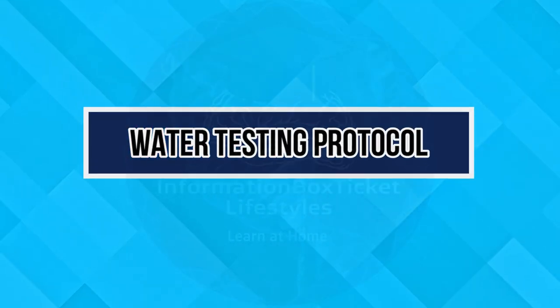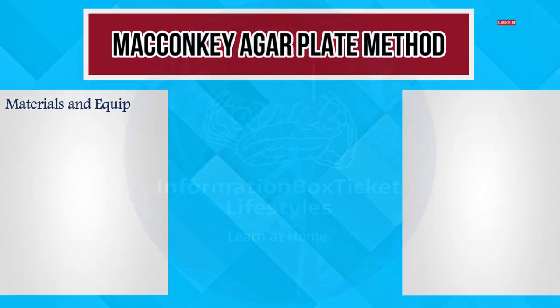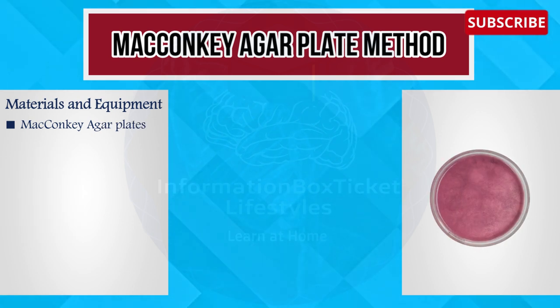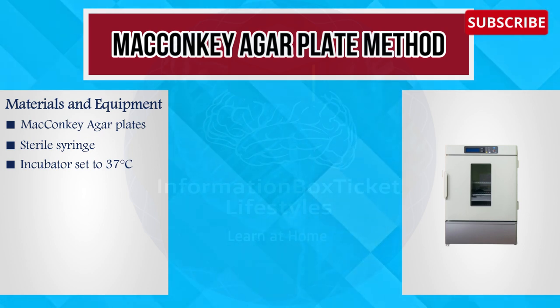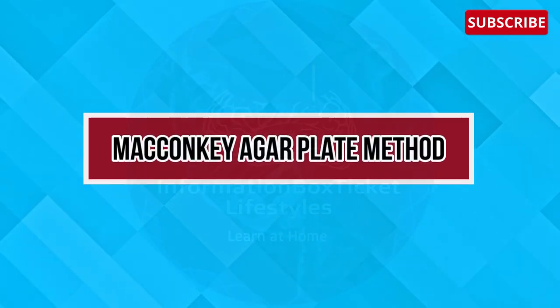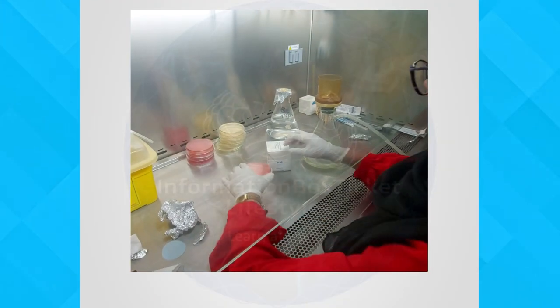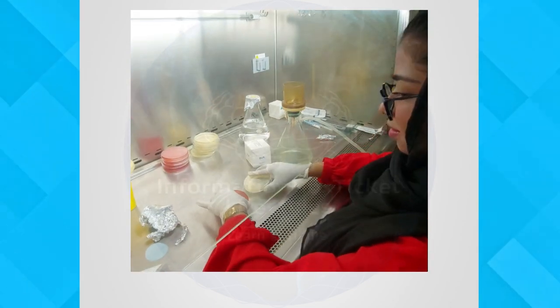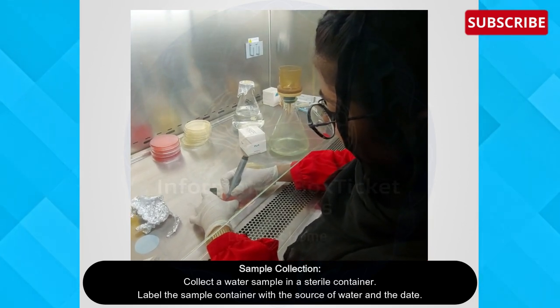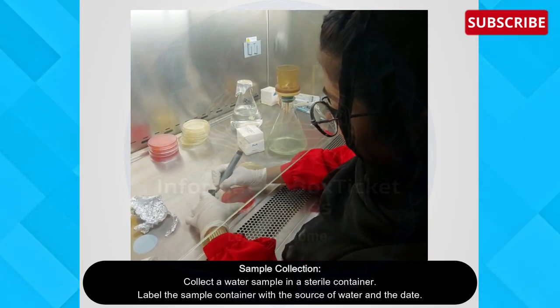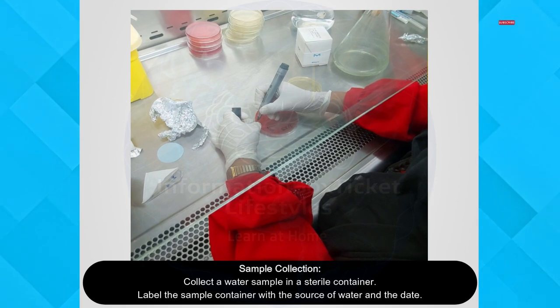Now let's begin with the procedure of water testing. The first test is the MacConkey agar plate method. Let's start with water testing through the MacConkey agar plate method. Ensure the MacConkey agar plates are sterile and ready for use. Collect a water sample in a sterile container. Label the sample container with the source of water and the date, and make sure to label the plates as well with the date and water sample name.